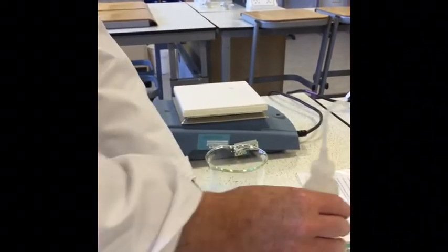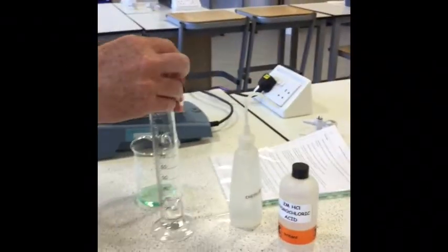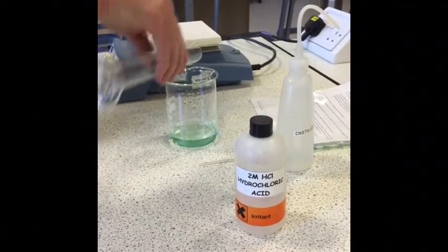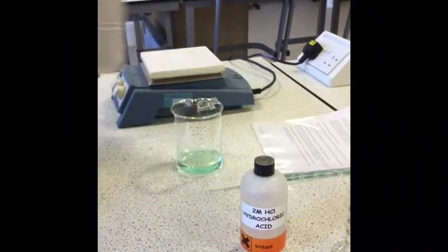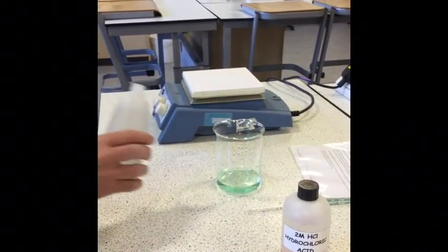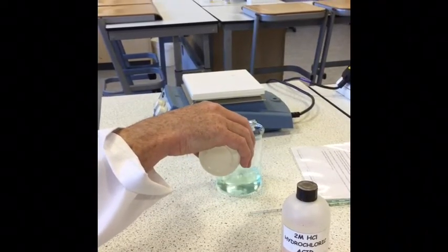Okay. Right. So now we add 20 cubic centimetres of 2 molar hydrochloric acid. And then dilute the mixture with deionized water to about 200 cubic centimetres. We just use the markings on the side of the beaker. It just has to be approximately 200.